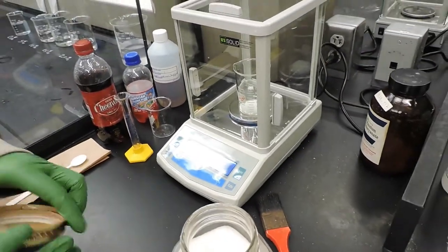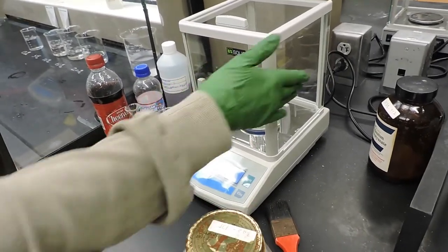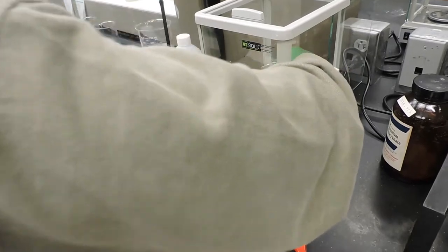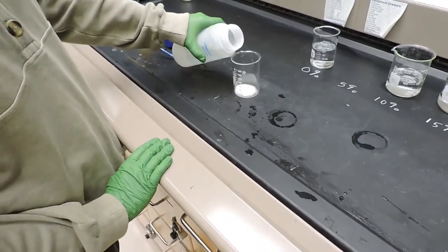Now that we have our 5.056 grams of sugar in the beaker, we will take the beaker and add to it approximately 75 milliliters of DI water.